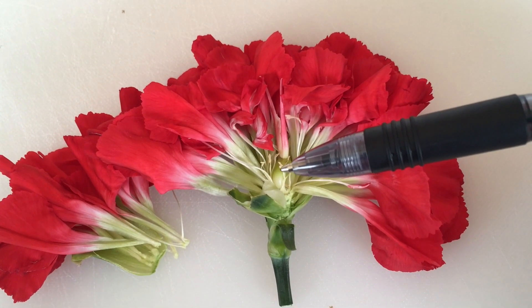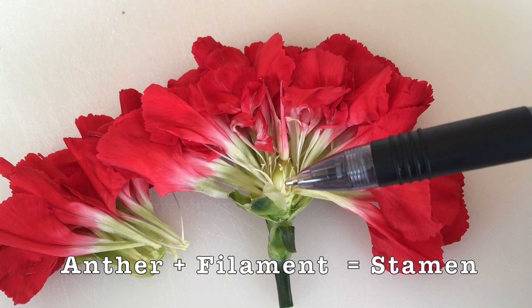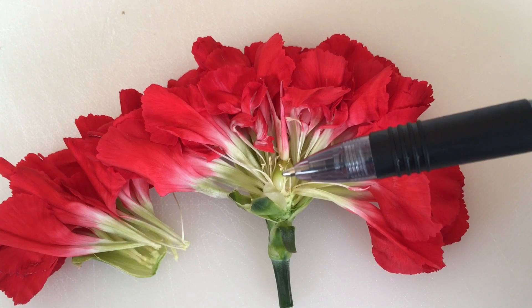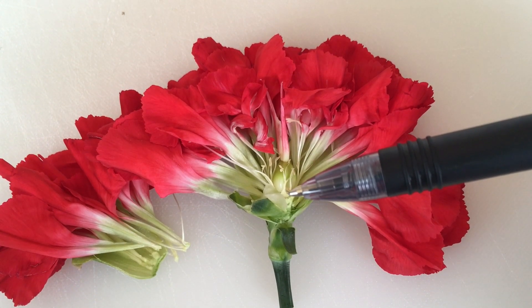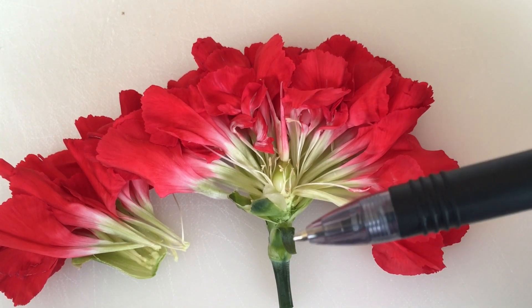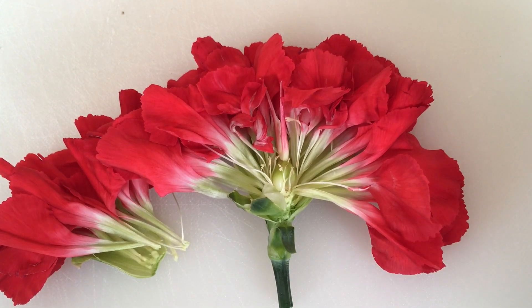Looking a little closer, these smaller stamens are the male reproductive parts. The top is the anther, and the part that holds it up — the long skinny part — is the filament. We can still see all of our petals, our calyx, and our stem that we identified before.